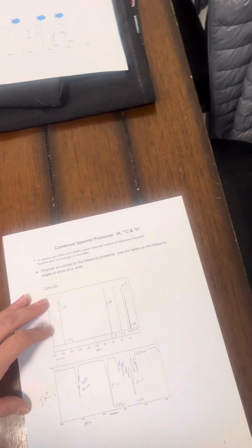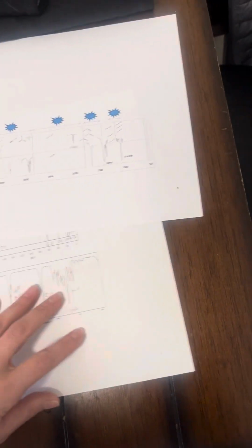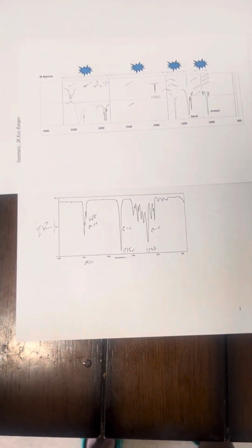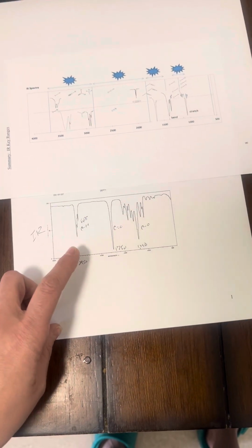And we're going to go down to our IR spectra analysis. It's upside down, my apologies. Nope, it's upside down this time. Do it this way. Do the same thing to help determine what kind of molecule we might possibly be working with.